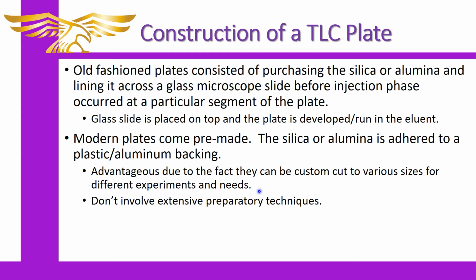And that's advantageous because you can cut those plates into various sizes. You don't have to have a glass slide custom made to fit the material, because before, what you had to do was take a microscope slide and smear the material on the slide, then you spotted it, then you put another on top and you ran it.